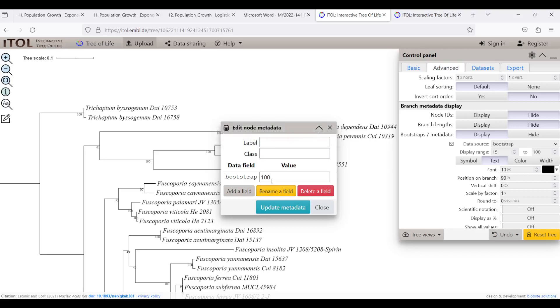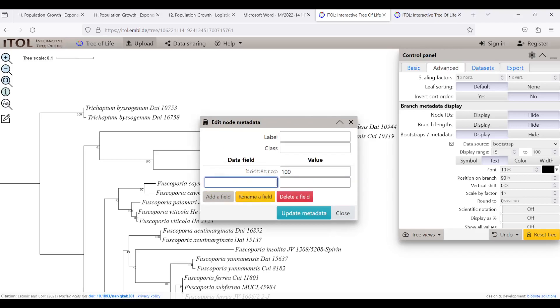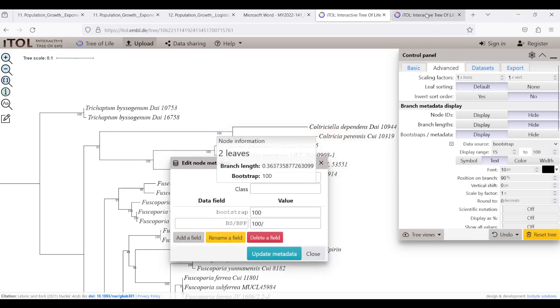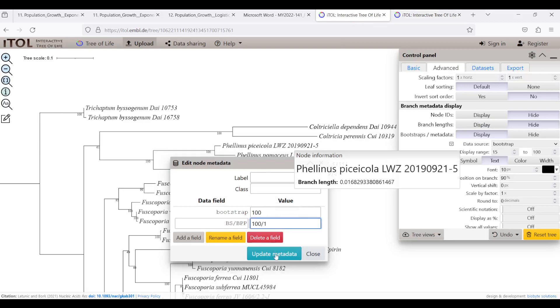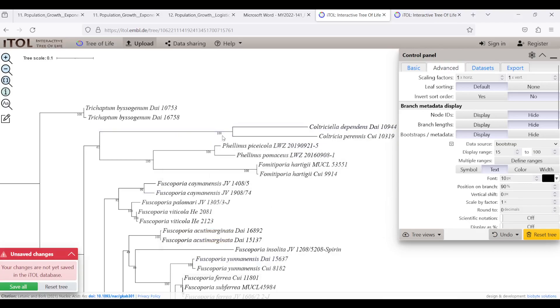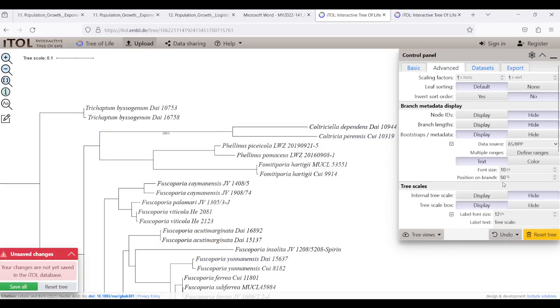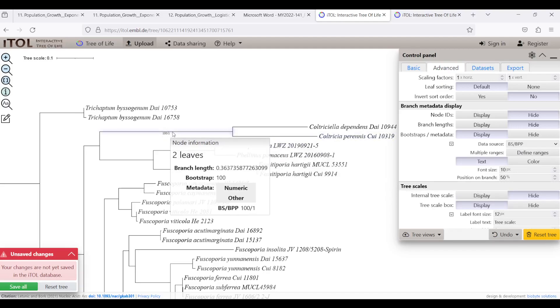In the metadata you can see the bootstrap values are already there — we are not going to change those. We are going to add a new field — you can name it something like 'BS/PP' for bootstrap slash Bayesian posterior probability values. First enter the bootstrap value, for example 100, then find the corresponding node in the Bayesian tree and enter its posterior probability value, for example 1. Then click update metadata.